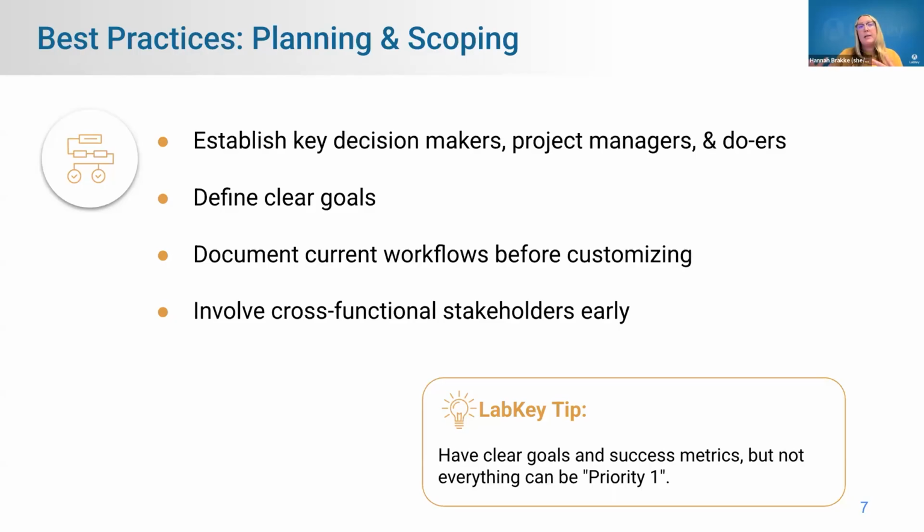But we've also had, in some rare cases, folks come in with goals that have been established within a small team that have not been evaluated or vetted by the rest of the team, and then as the implementation is going on, it starts to uncover that those actually aren't in alignment. And so making sure that those goals are very clear and also aligned with the entire team, that everybody can agree what's the top priority or what is ultimately the goal of the LIMS.